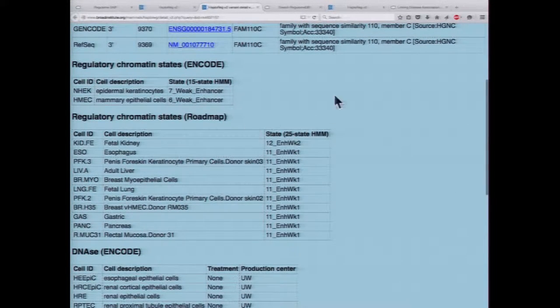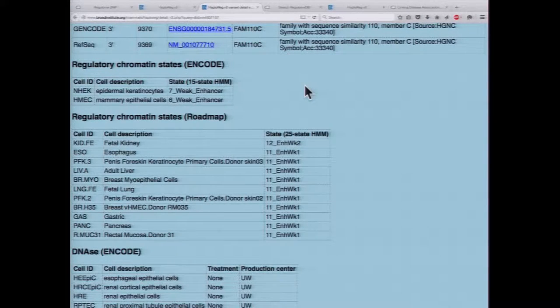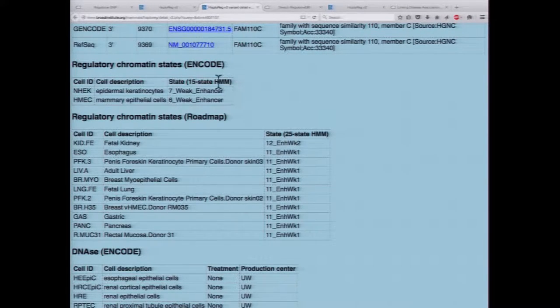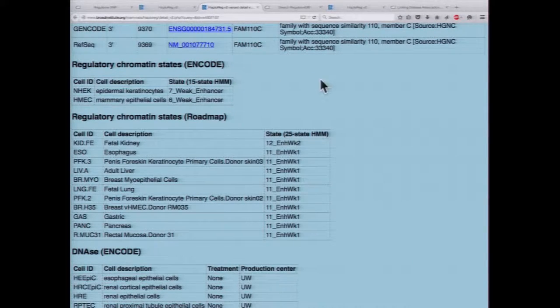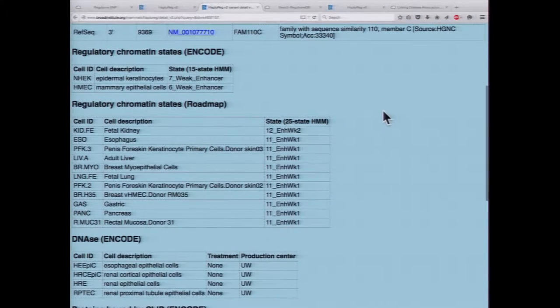Once again, you have regulatory chromatin states from ChromHMM done on ENCODE cell types as well as Roadmap tissue types. You can see different state predictions — this region is predicted as an enhancer in these tissue types as well.